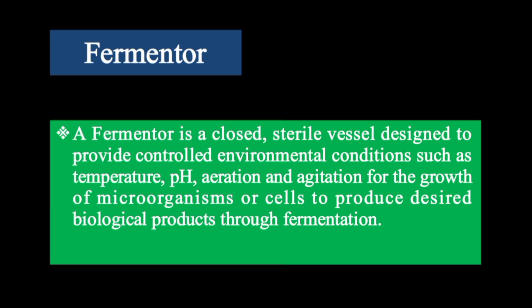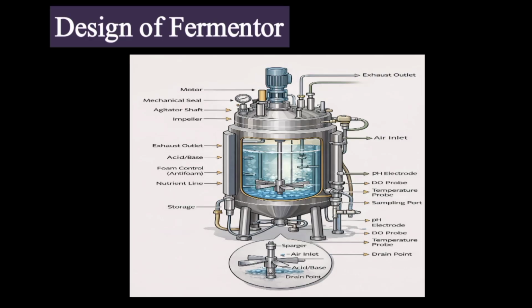First, we'll see what a fermentor is. A fermentor is a closed, sterile vessel that is designed to provide controlled environmental conditions such as temperature, pH, aeration, and agitation for the growth of microorganisms or cells to produce desired biological products through fermentation.